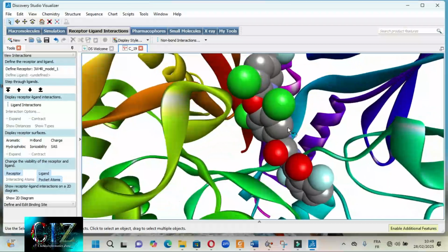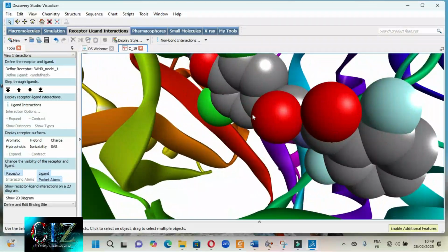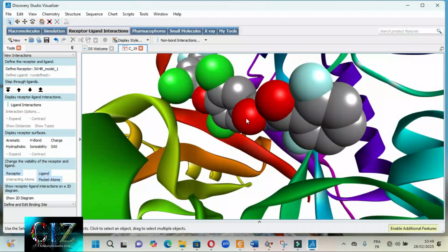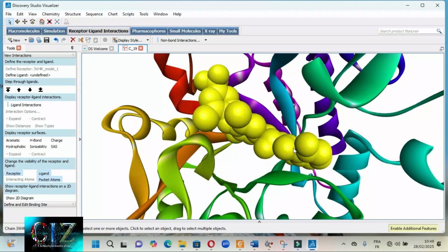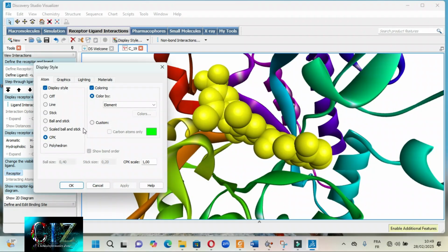And here we don't have any information about the kinds of interactions, nature of bonds, or nature of angles involved between the atoms inside the molecules. That's why it's not generally used for presentation of results. We generally use, in terms of presentations, scale ball and sticks or just ball and sticks.